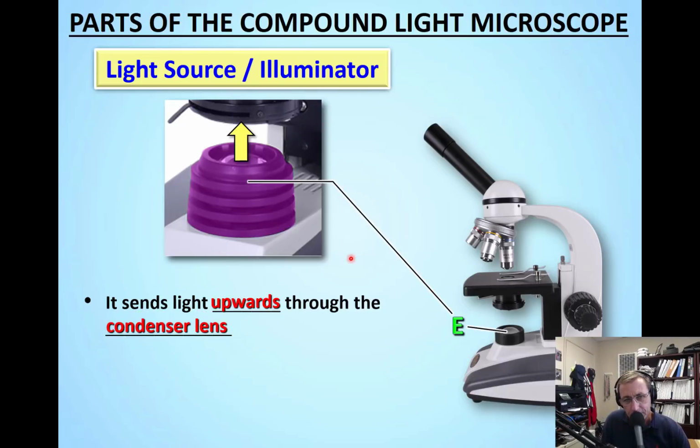Okay, so the condenser lens is right here. So you see it kind of bringing that light in, focusing it, because you want to have the light as focused and bright as possible and not just going out into the room, because that would be useless. So they have this lens on there, the condenser lens, to try to focus the light and maximize the benefit of the light.